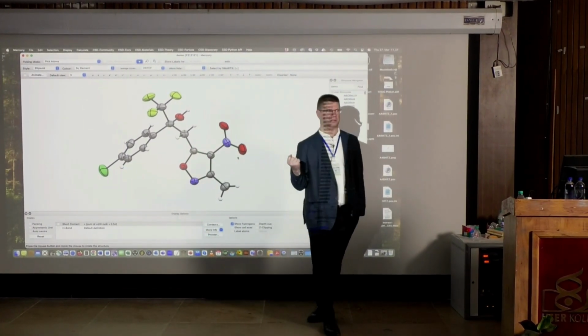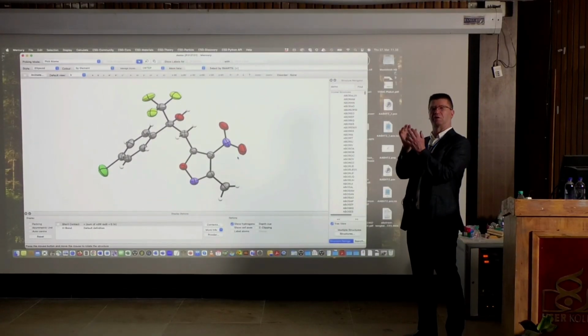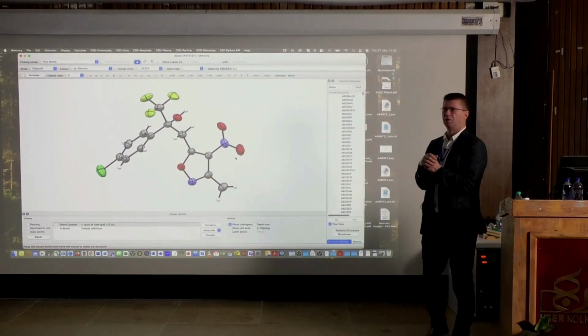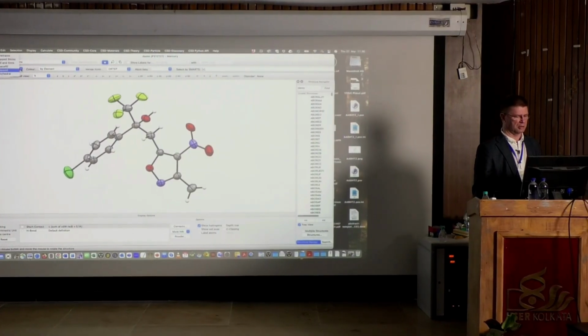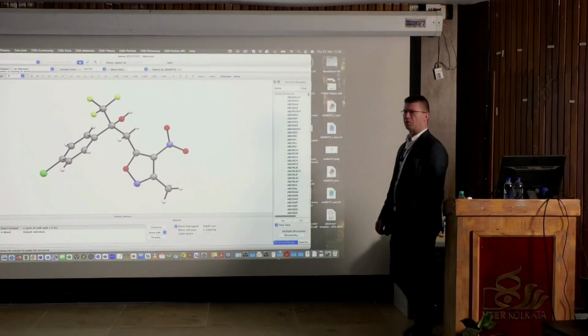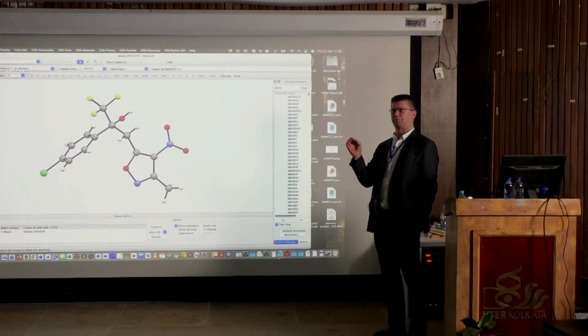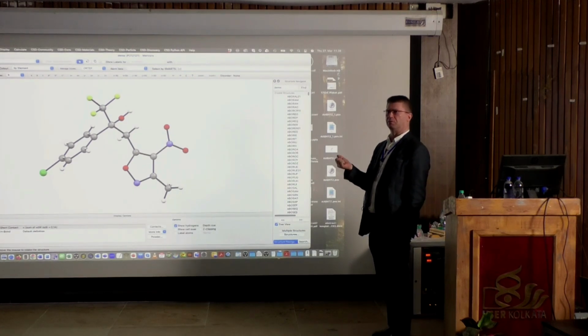And sometimes you can have a really complicated structure. So it's like I was showing yesterday, the spheres, the molecular spheres. There's always, because it's a three-dimensional object, whenever you turn it around, there's always something on the back. But if you have this kind of a simple molecule, then it's easy to do this. And the point in here is that we can here easily change the presentation style. This is the classical ball and stick presentation, where all the atoms are presented as balls. But this is of course not the real one. The previous one, when you have the ellipsoid, is the real one.